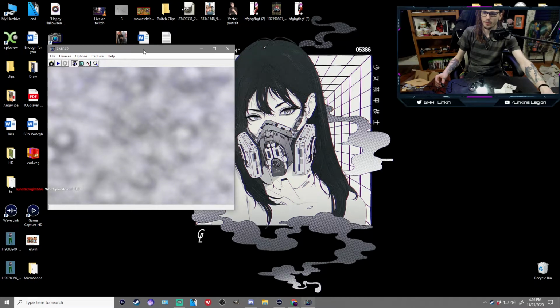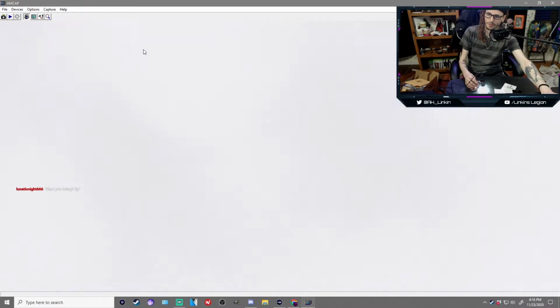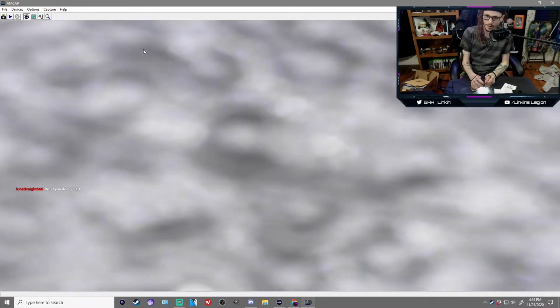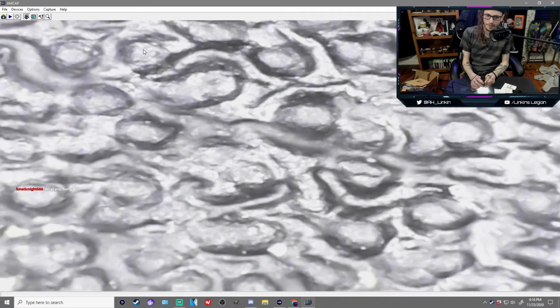Hi, Luna. Luna, we are using this little microscope. It's a USB microscope to zoom in really close and look at things. So as you can see, this is the table that I'm on right now, and those are the woven fibers of the plastic that we're looking at.